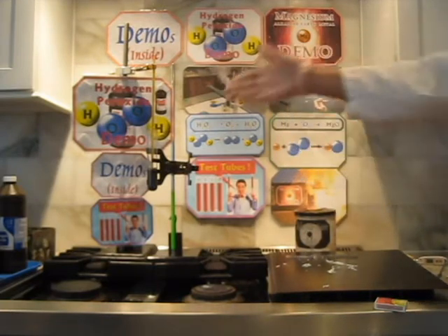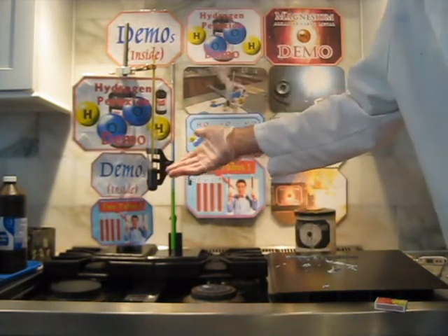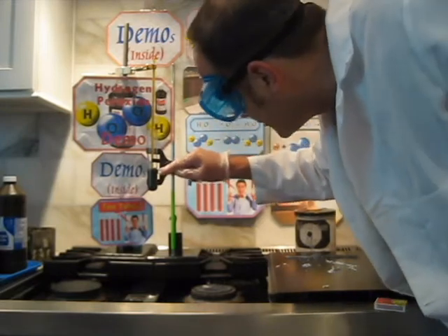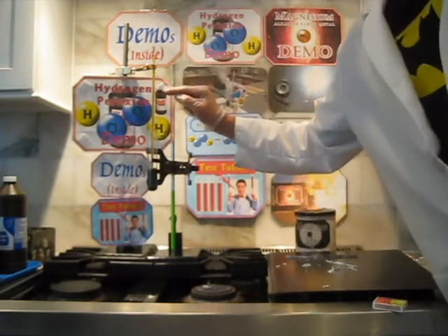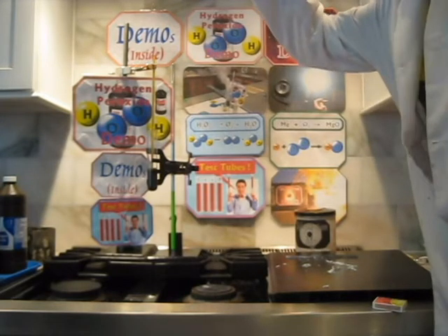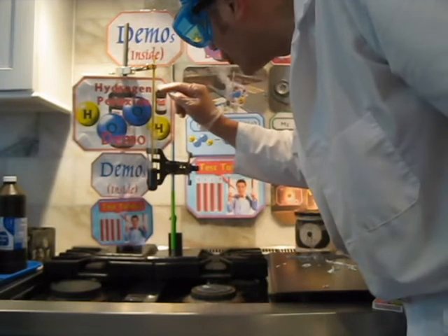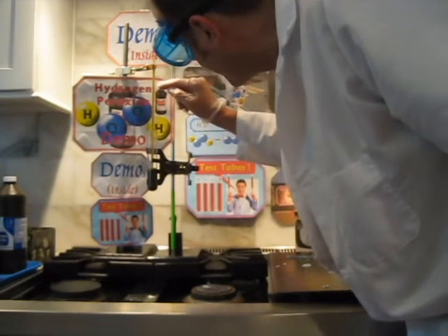Okay. The other one, of course, was the hydrogen peroxide that we did first, and that reaction is now pretty much over. So look over here. What's left? Oh, no, it's still going. And our temperature, oh yeah, look, 85 degrees. It reached 85 degrees Celsius, so it took a while to get there. I think that might be the maximum temperature for the hydrogen peroxide, about 85 degrees. Yeah, because now it's going down to 84.